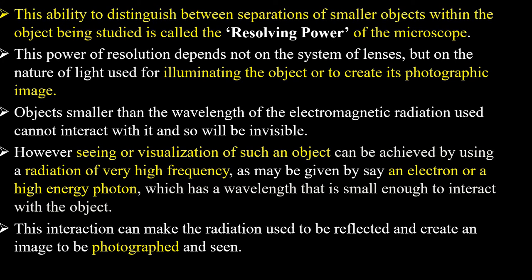This ability to distinguish between separation of smaller objects within the object being studied is called the resolution or resolving power of the microscope. That means this ability to distinguish between separation of smaller objects within a particular object which is studied is called the resolving power of the microscope.